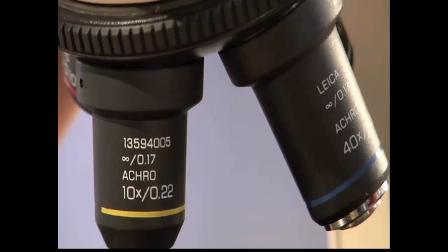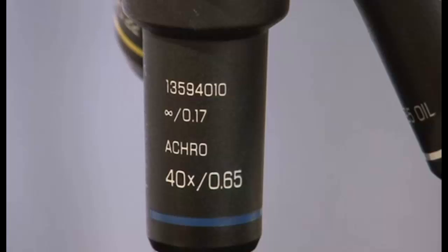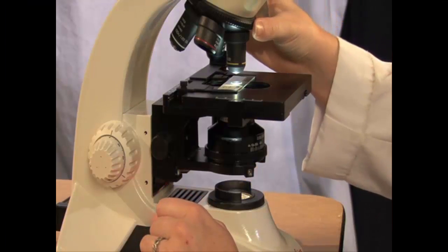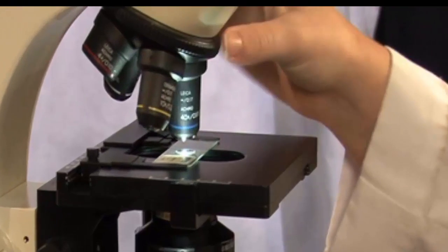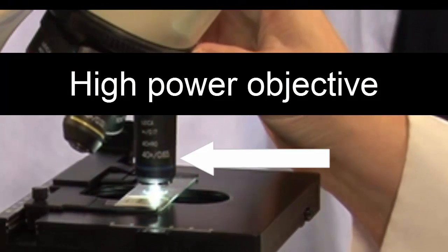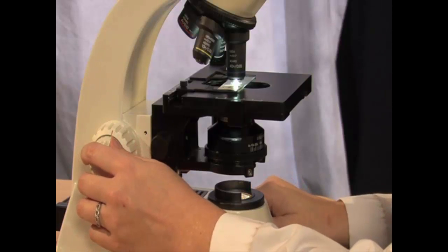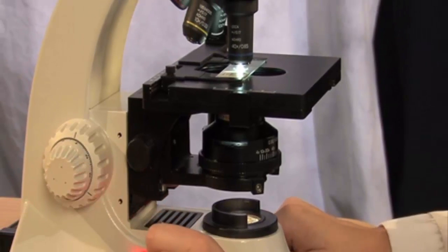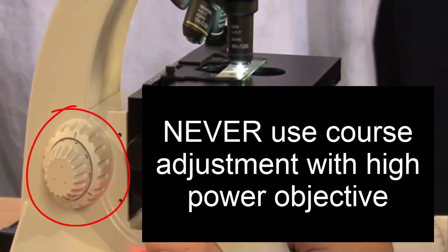After you have viewed your specimen with the low power objective, you are ready to move to the high power objective. Just like we did with the low power objective, turn the revolving nose piece so that the next objective will click into place. Put your eyes to the ocular lenses and you should see your letter E. It may be out of focus, but that's okay. To get a sharp, crisp image, use the fine adjustment knobs only. Never use the coarse adjustment knob with this high power objective.